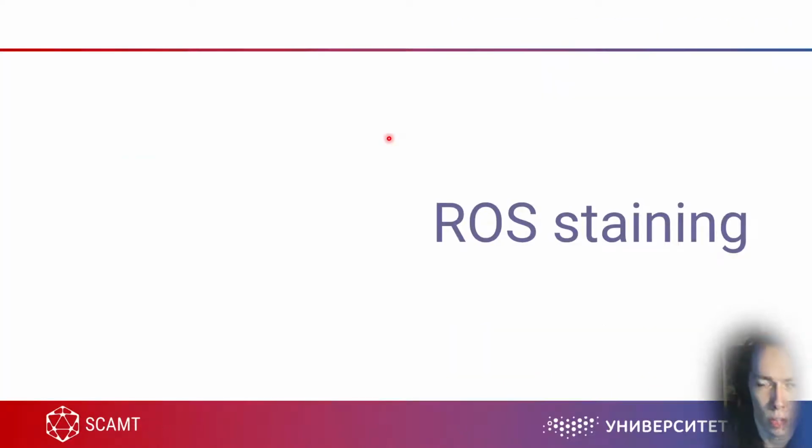And since we talked a lot about reactive oxygen species, there should be some ways to stain them. But as you understand, there is no way to stain ions, because these species are ions or radicals. There is no way to stain just a couple of atoms. But still, you can use their ability to oxidize other molecules to visualize some outcomes of the production of reactive oxygen species.